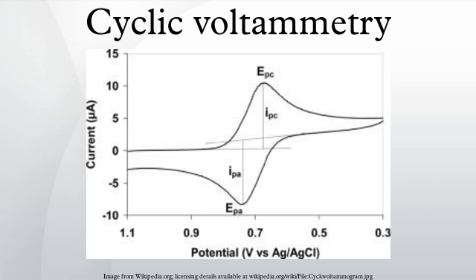Common materials for the working electrode include glassy carbon, platinum, and gold. These electrodes are generally encased in a rod of inert insulator with a disc exposed at one end. A regular working electrode has a radius within an order of magnitude of 1 mm. Having a controlled surface area with a well-defined shape is necessary for being able to interpret cyclic voltammetry results.